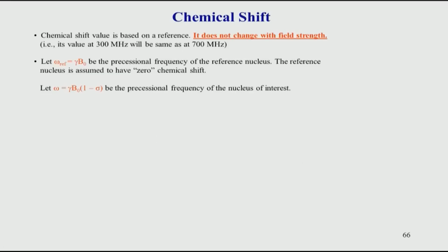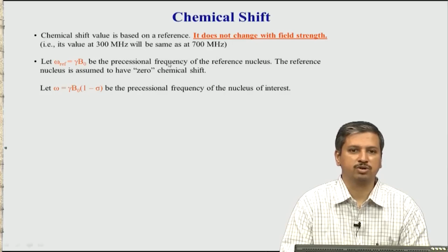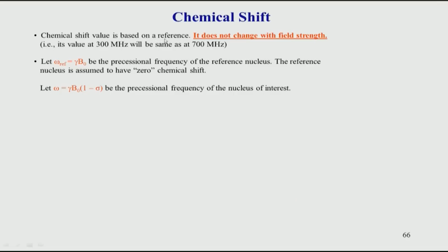So, now let us see how this ppm scale is calculated. For understanding this, one should keep in mind that a chemical shift is always based on a reference. So, why do we use the word reference?